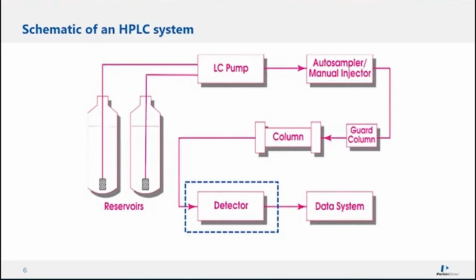For those of you who attended previous presentations, this graphic should be familiar. In the prior talks, we discussed general fundamentals of liquid chromatography, the purpose of the different parts of the hardware, and a deeper dive into how to select a column for your analyses. Today, we're going to focus on detecting the analytes through a variety of modes.